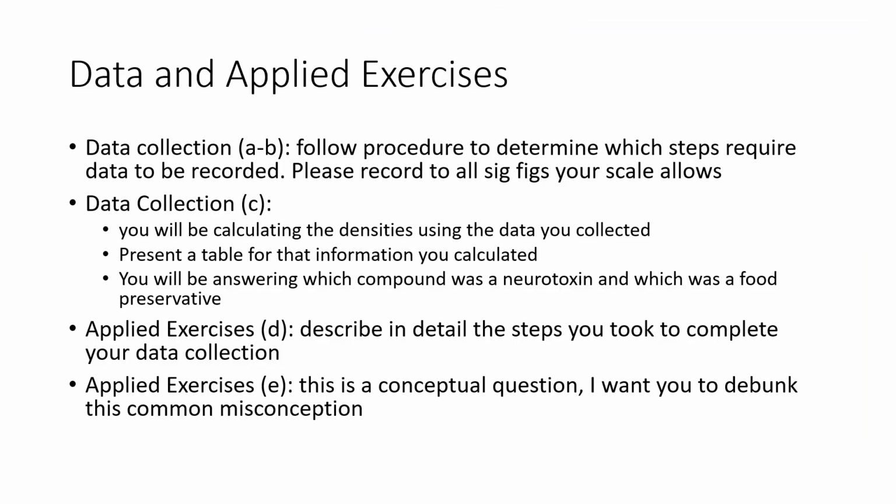So in terms of the data that you're collecting and then the applied exercises after, you're essentially just following the procedure. It tells you when and where you're going to be recording data, and then the table also guides you through. Please record all the sig figs that the scale allows, so don't cut it off just for no reason, record all of it. And then that's for part A and B.